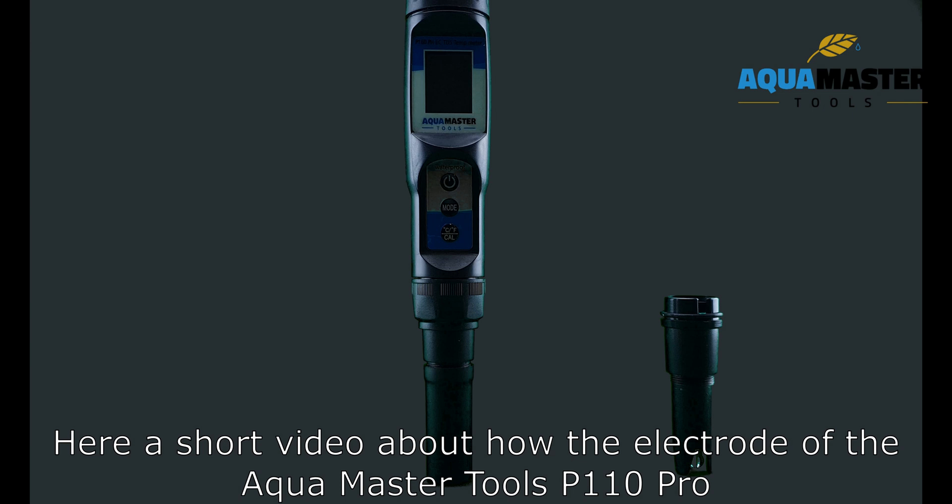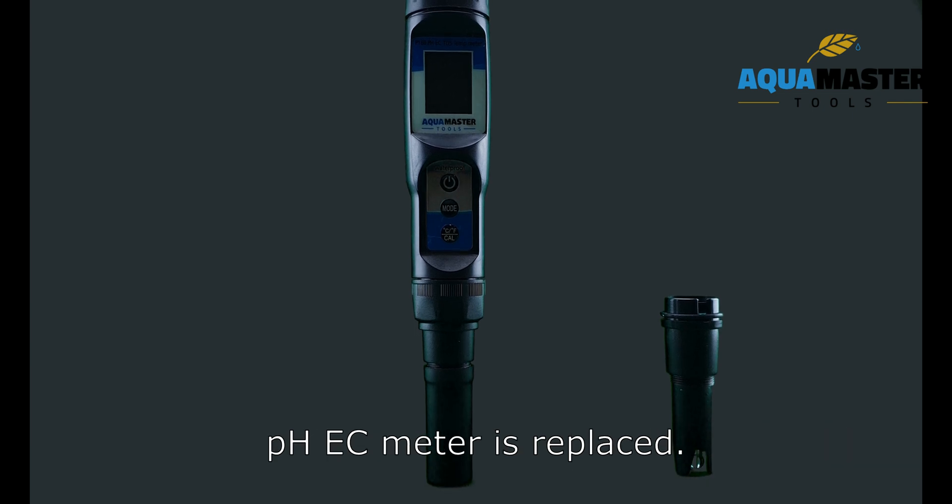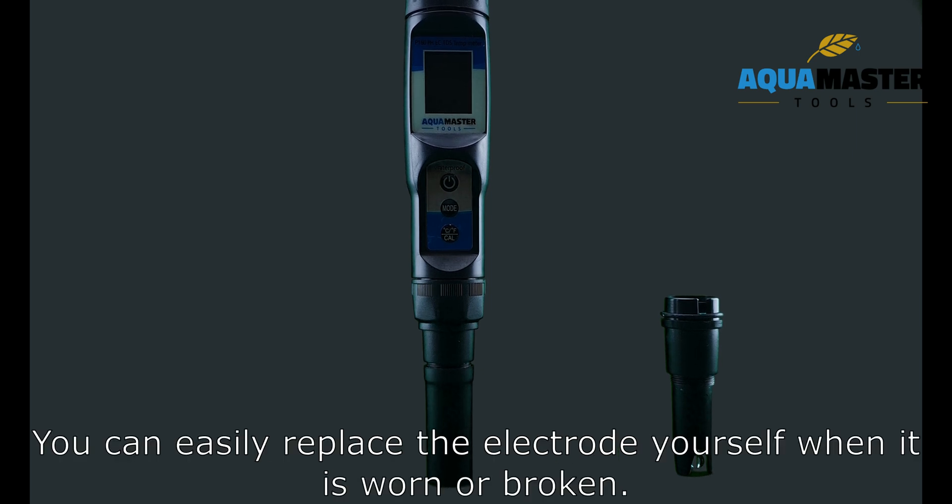Here is a short video about how the electrode of the Aqua Master Tools P110 Pro pH EC meter is replaced. You can easily replace the electrode yourself when it is worn or broken.